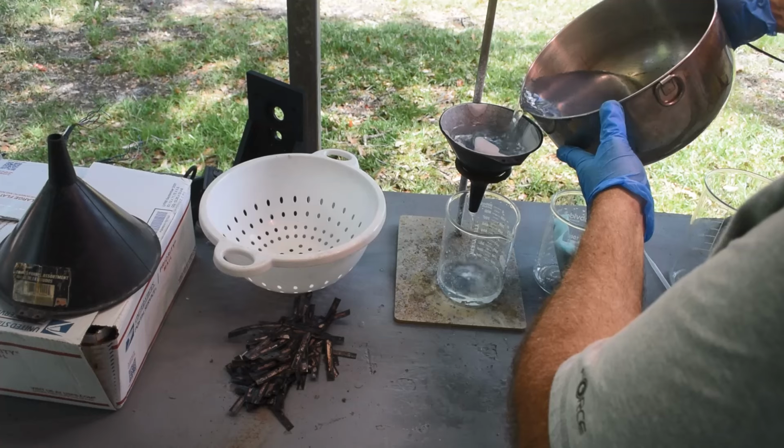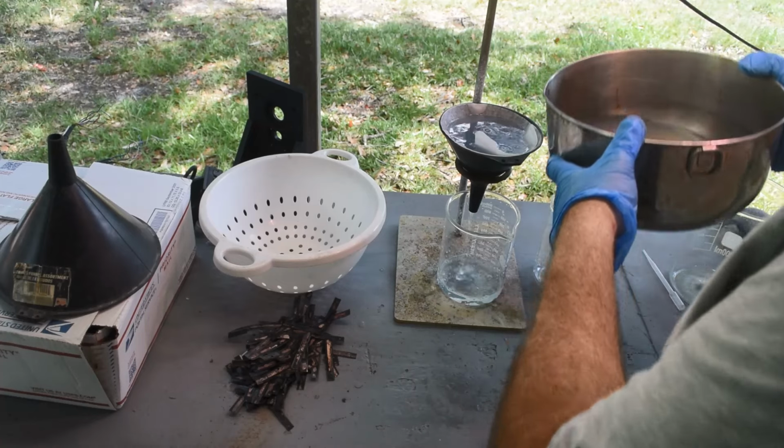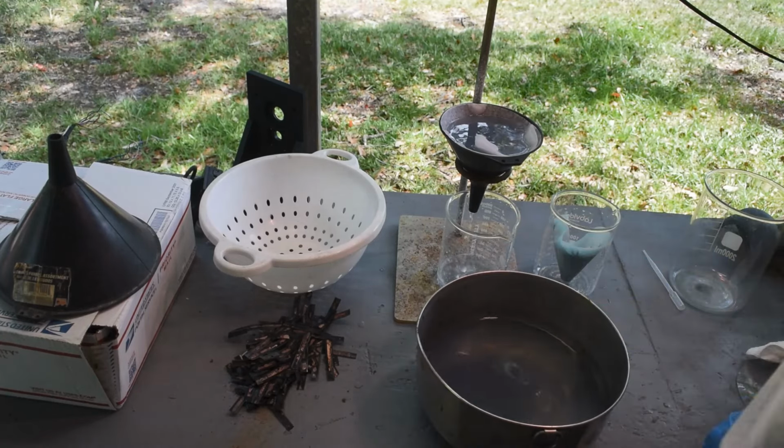And then once we have the palladium separated, we can decide what we want to do with it. All right, so this is going to take a little while. I'll be back when it's done.